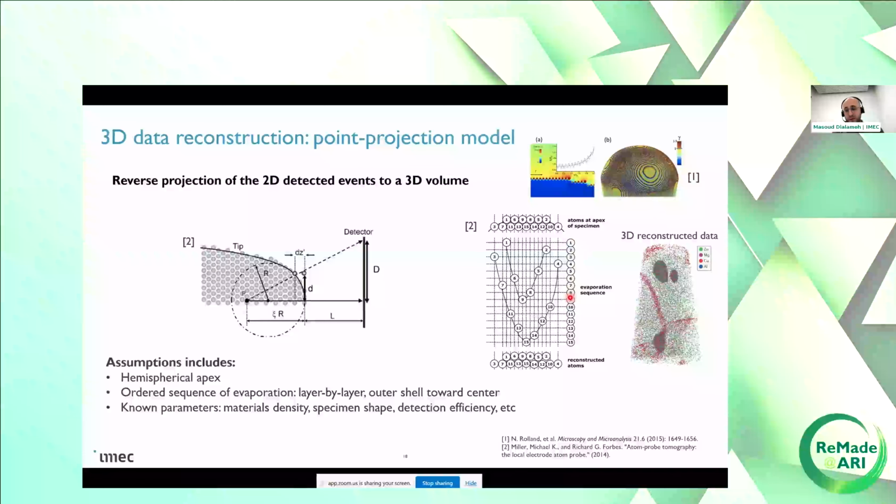So what we obtain from the detector, we want to put together and reconstruct basically according to what was originally on the specimen. For instance, the first detected event belongs to the left corner, and then the second one from another side of the lattice. So the sequence here matters.